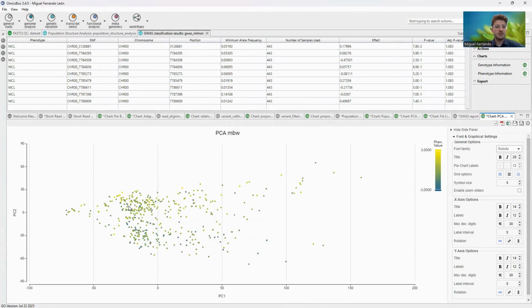We have a mix of all of the individuals with different phenotypic values. Before studying the phenotype information, we first need to see what the phenotypic values are on each specific individual, and whether they cluster or not.